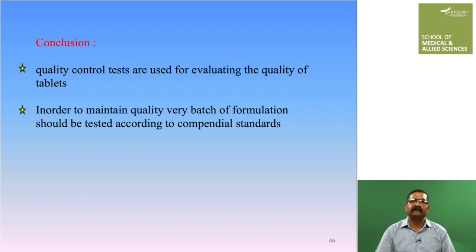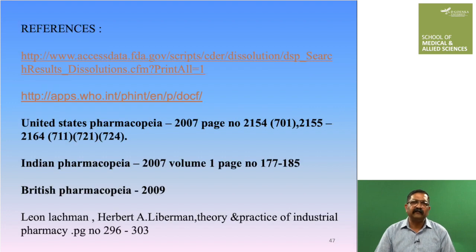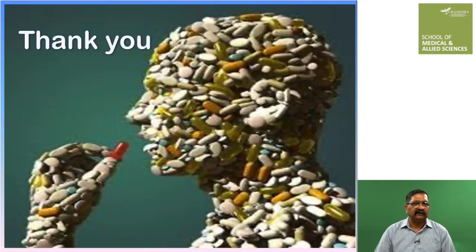The conclusion of the presentation is that quality control tests are done for the tablets in order to maintain the quality of the batch and should be tested according to compendial standards. Here are a few standards which I have used in the presentation. That is all, a brief account of the quality control tests of the tablet.